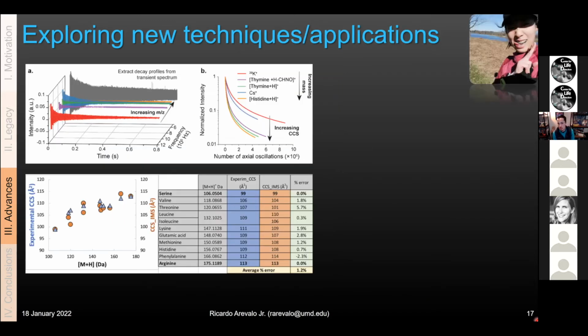And so here's another picture of Grace. What she's been leading is to consider less conventional ways of using an Orbitrap to derive more information about the sample. There's a slowly growing community, like a snowball effect, looking at what happens to those ions when they're inside the Orbitrap.